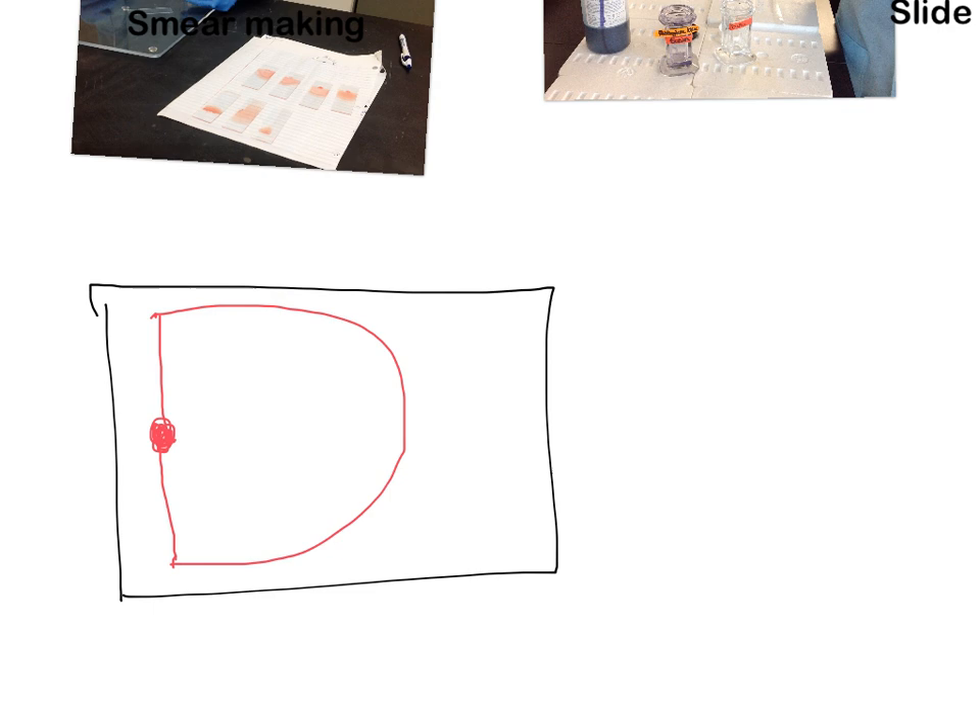When we make a smear with a feathered edge, it helps to decrease the amount of margination present. If your smear has long spiky pointy edges, there's a greater tendency for bigger cells to be on the outside and smaller cells inside — but you can't count both areas simultaneously during a differential. So the more margination you have, the greater the error in your differential.